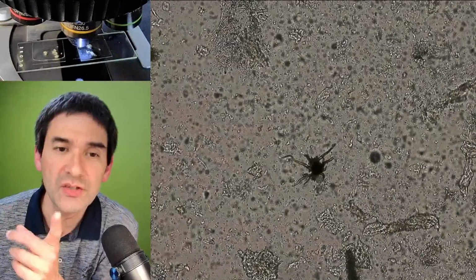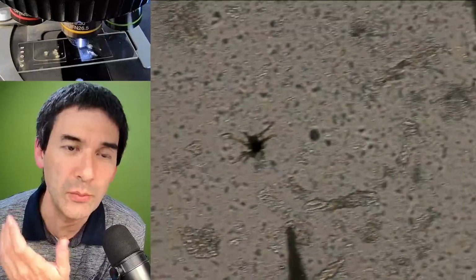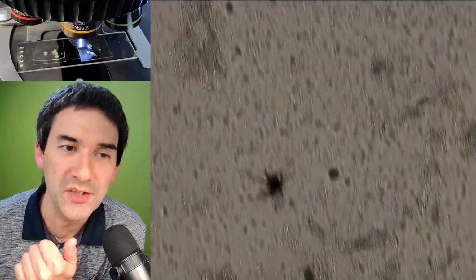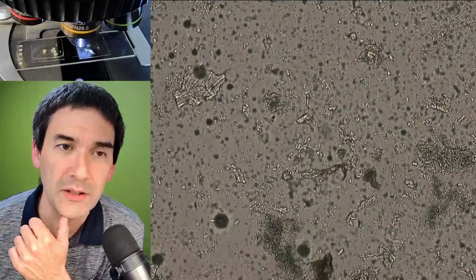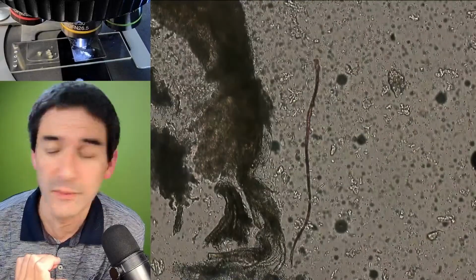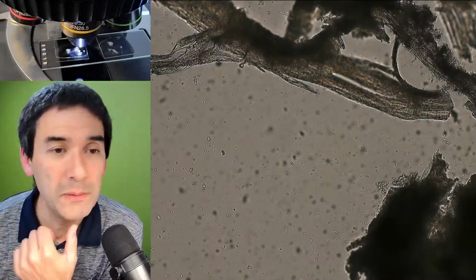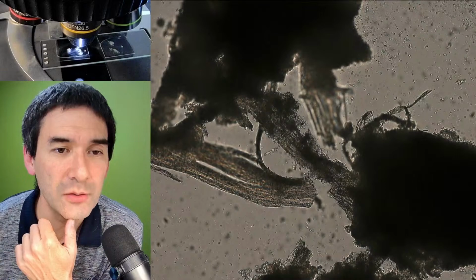This trichome here, I would not put too much emphasis on that. It could indeed be because I did not properly clean my tweezers. But essentially, this is what vegan or soybean-based meat looks like under the microscope.